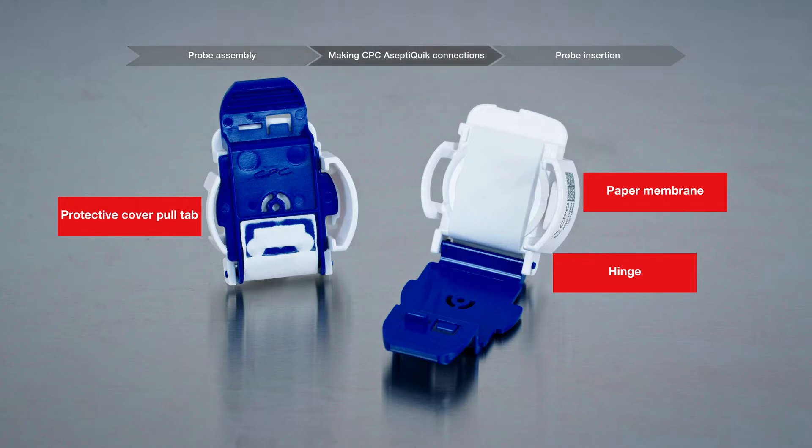CPC AseptiQuick G genderless connectors are used to make sterile aseptic connections. Connectors with white protective cover pull tabs may be autoclaved. Generally, connectors with blue pull tabs are gamma irradiated, not autoclaved. Visit the CPC website for more information.